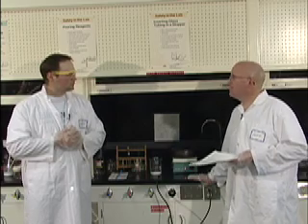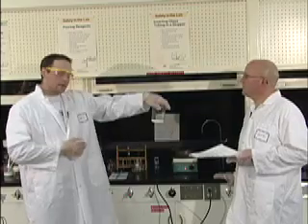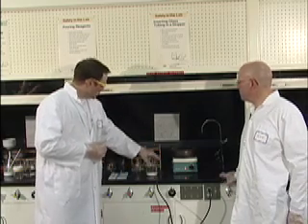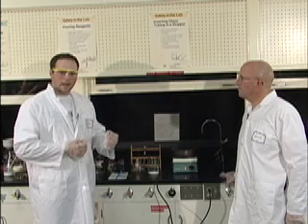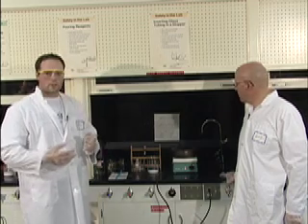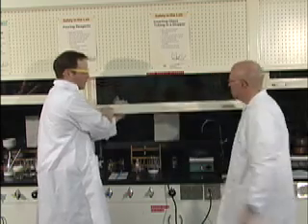Very good. I'm ready. You ready to go? Let's put some things together. Again, we have our 27.5 grams of salicylic acid in our 600 ml beaker. We're going to take our acetic anhydride and pour it over our salicylic acid. Acetic anhydride has very, very strong fumes. You want to make sure you're doing this as far in the fume hood as possible. You also want to have the fume hood door down as far as you can while reaching underneath.